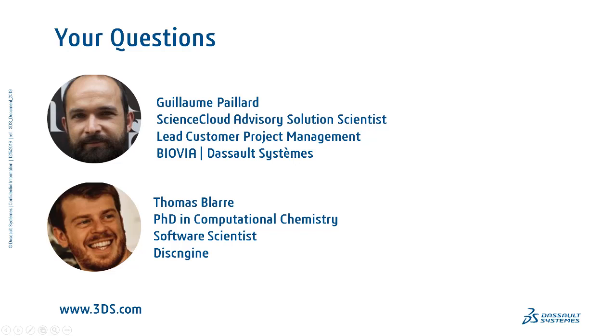Great. The next question: can I reanalyze my data if my data processing workflow evolves over time? Yeah, so I quickly mentioned that. One important point that Thomas made in the discussion is that all the executions, either through Autopilot or in Assay, are recorded and reversible. So that's one thing.